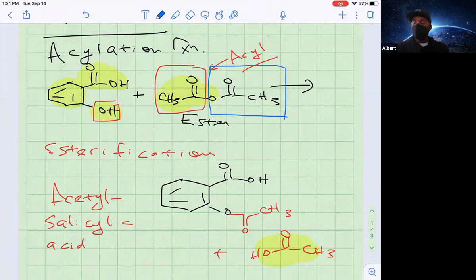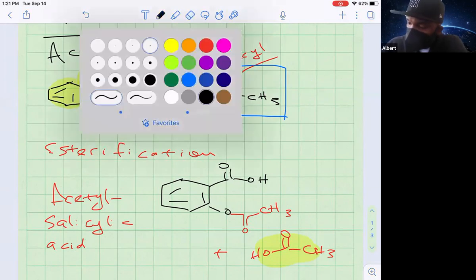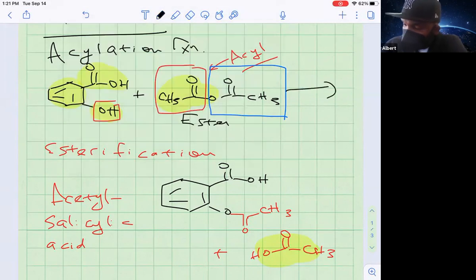All right. So we're doing the reaction in the presence of sulfuric acid. Fix my arrow. So sulfuric acid, H2SO4, deadly stuff, but we're only using a catalytic amount. And we're heating this up. So we're going to use a water bath.